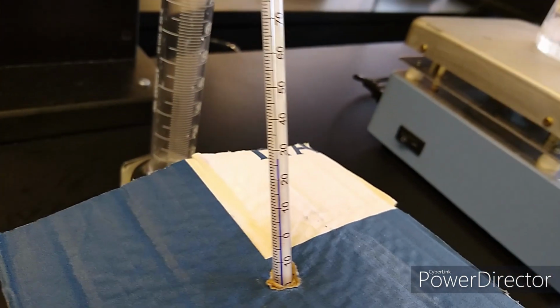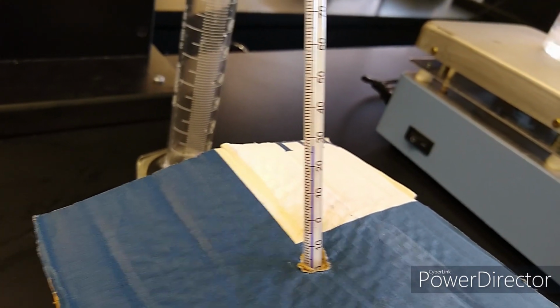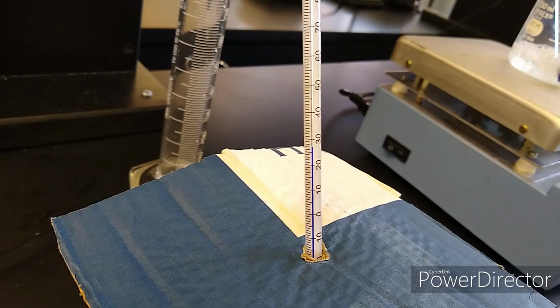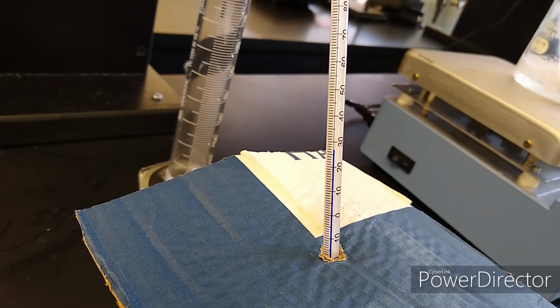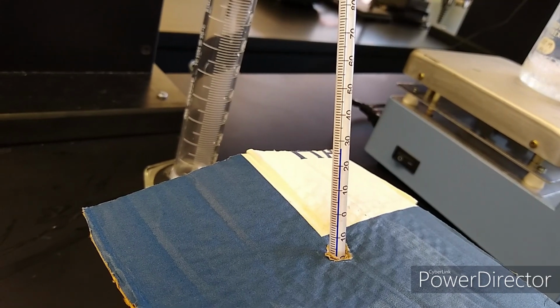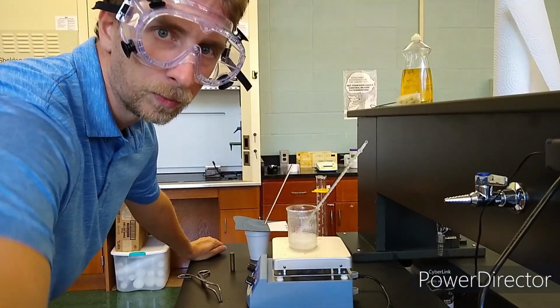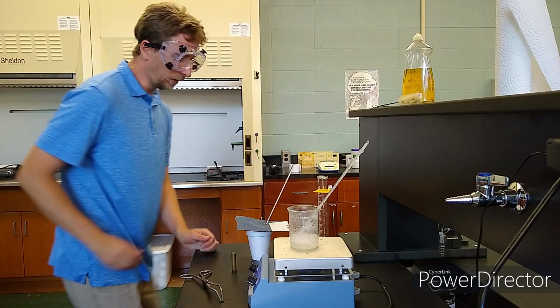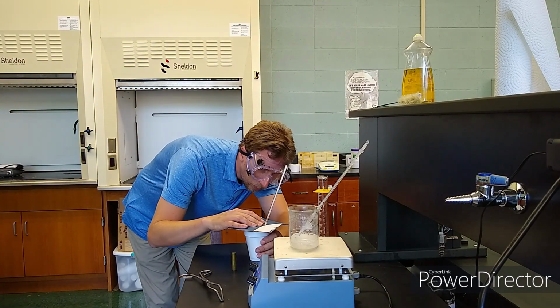So we're interested in the maximum temperature of the water inside the calorimeter cup. And 27, I'd say it went up a tad bit to 27.2 or 3. Okay. So that's about it though. Let's say 27.2 is the maximum temperature that it went up to.